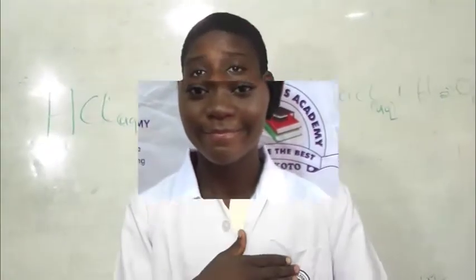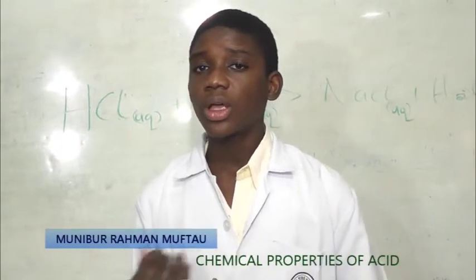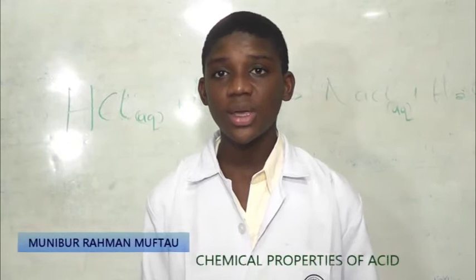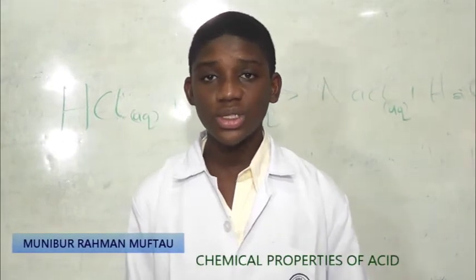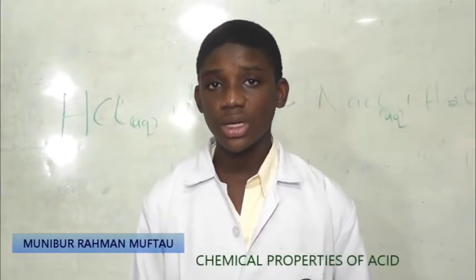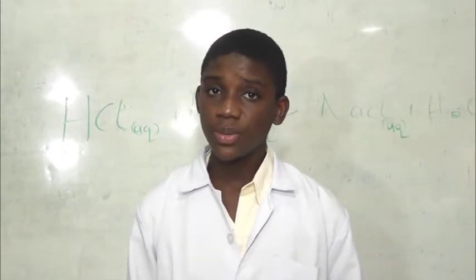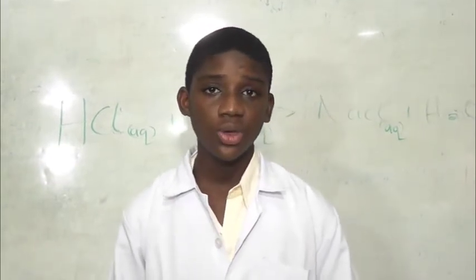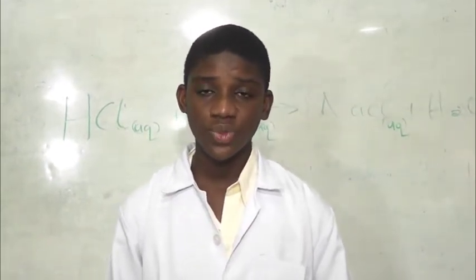Dear viewers, my name is Munibur Rahman. As you've been told earlier by the host, I am here to demonstrate the wonderful chemical properties of acid, which include neutralization reaction and displacement reaction. Please don't try the displacement reaction at home. So before I forge ahead, I would like to tell you more about neutralization reaction.